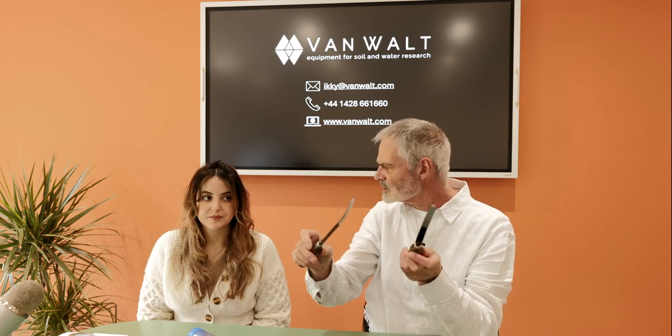soils. We tend to prefer these very straightforward spatulas. They come in, I think, is it 3 sizes, Icky? 3 sizes, yeah. Come in 3 sizes, depending on the width and dimensions of your sampling auger. Which one you would use? Cheap, easy to use, and saves your fingers.